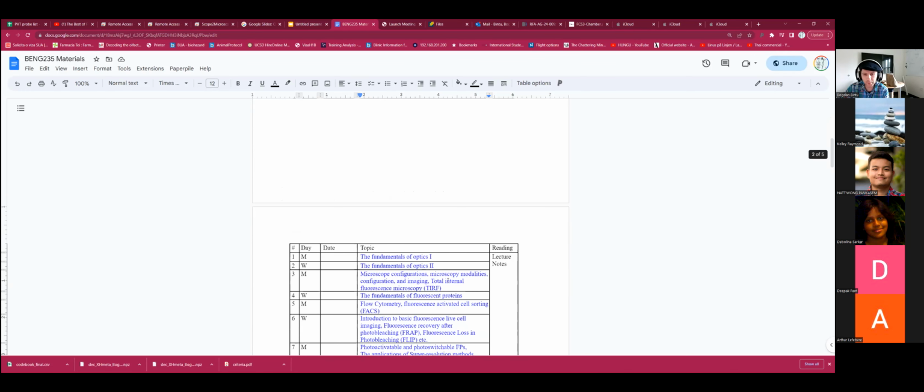Okay, good. So that's a very good point. Indeed, FACS, flow cytometry, is a super important thing for a lot of people, partly because of how easy it is to apply to cell culture and the quick information that you get back. So we're going to discuss it. And the good thing is, depending how many students we have, we likely won't be overwhelmed with students, so I'll be able to focus on including the needs that you might have, and we'll have discussions on that. For FACS sorting, I'll be able to provide some information from my perspective of how that could be useful, and we could have a discussion as well.